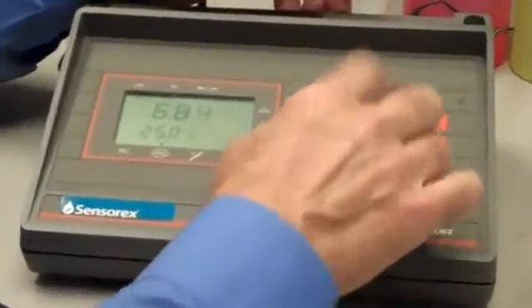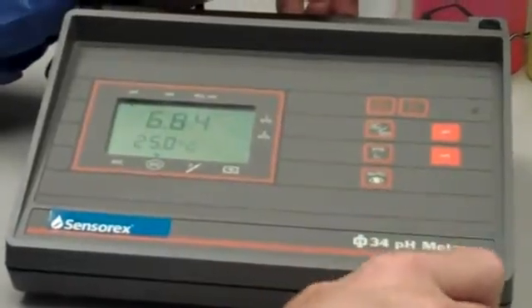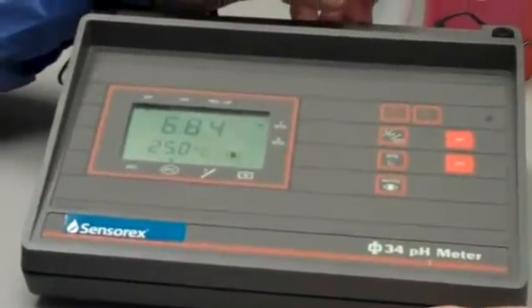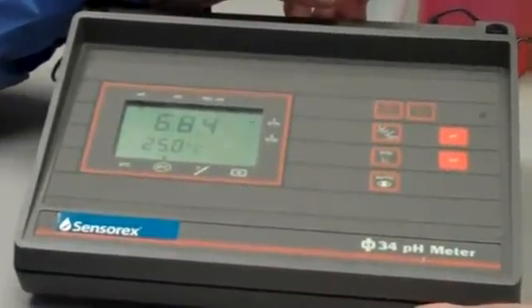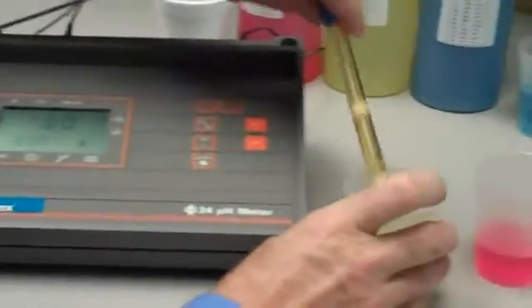For this meter, I hit the standardized button, and the meter will go through some steps to automatically lock in on the buffer 7. As soon as the display stops flashing, it's locked into a pH of 7.